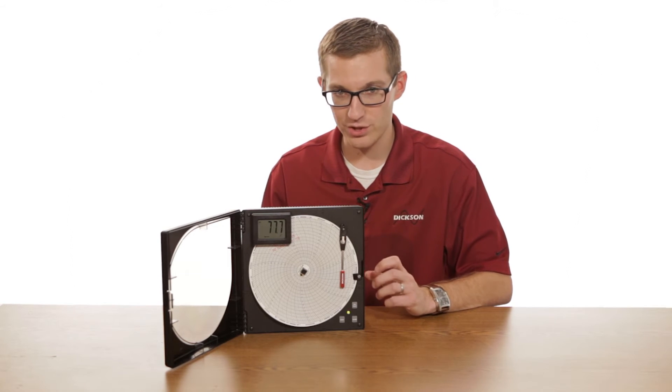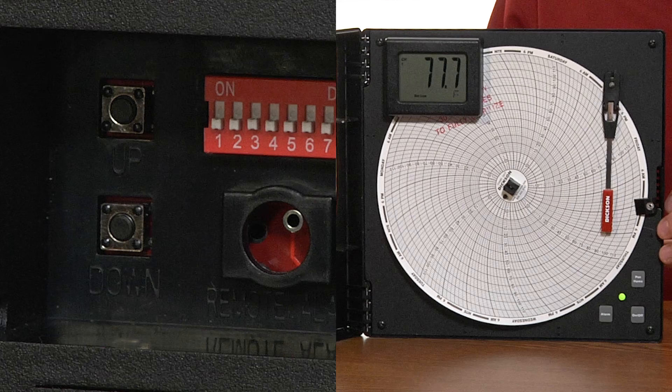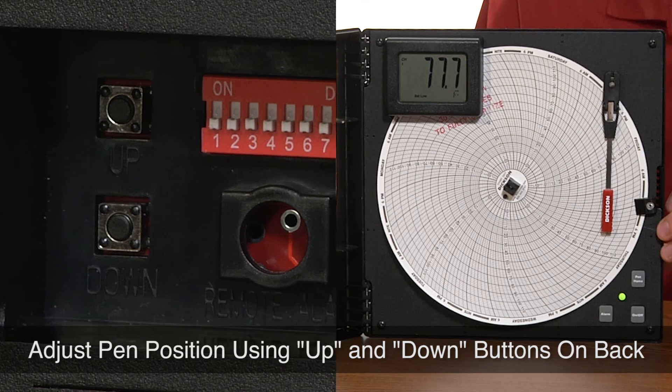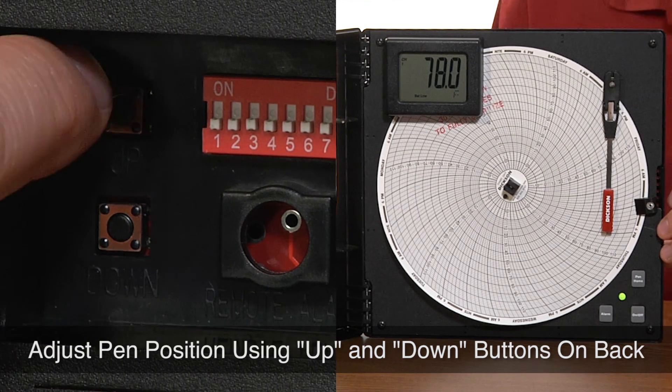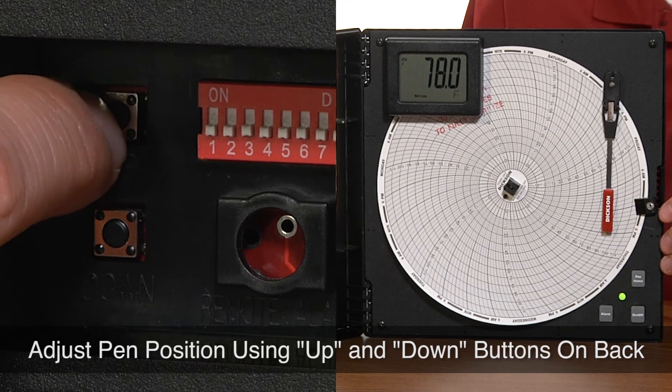So after that, now that we're in calibration mode, you can adjust the pen. There are two buttons on the back. There's an up button and a down button. So depending on what you want to calibrate it to, you hit that corresponding button.